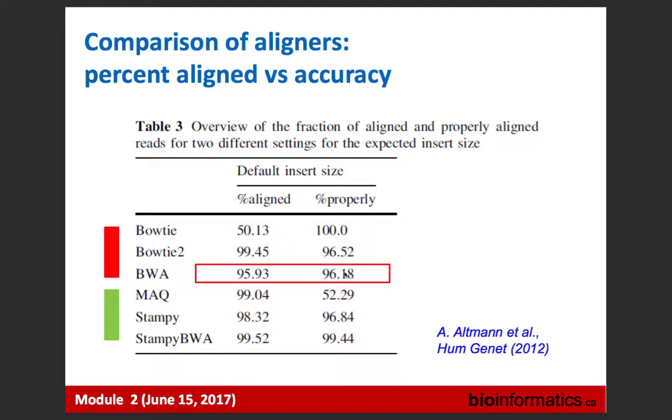Okay. So for example, when we get data from Genome Quebec, the data we get is aligned to a reference genome. Suppose our lab is using a newer version of the genome, say MM10, and Genome Quebec gave us MM9. If we have the data, then definitely there were some reads which were missed out, not 100% aligned, which Genome Quebec gave us. Is there some way to track the reads from the BAM file which were not aligned?